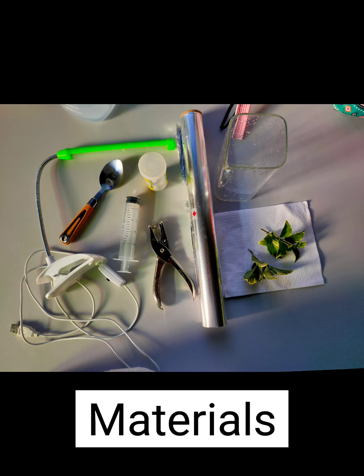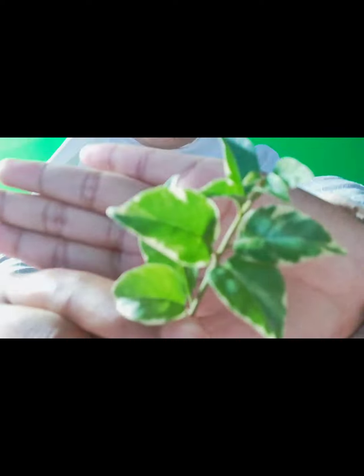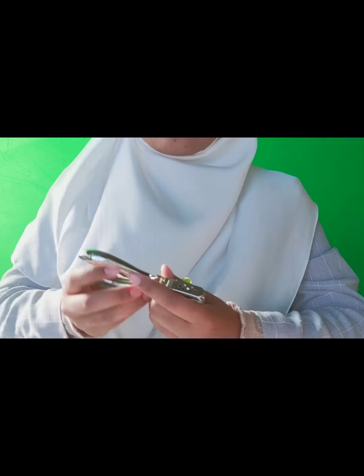In this experiment, we use plant, sodium bicarbonate, a water container, hole punch, table lamp, ruler, and lastly aluminium foil. The plant used in this experiment is bougainvillea, which is known as pokok bunga kertas.